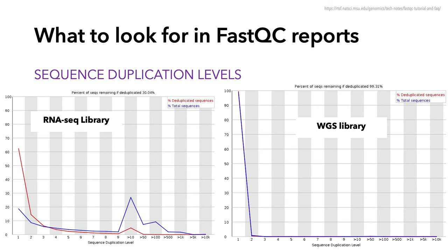Sequence duplication levels is one of the plots definitely not designed with RNA-seq data in mind. The blue line shows the percentage of reads of a given sequence which are present a given number of times. In RNA-seq, highly abundant transcripts will show up as duplicate reads, which makes sense. For whole genome shotgun sequencing, all your reads should be unique, so the blue line should be pretty flat. PCR duplicates during library prep will rightly raise a flag here, but for RNA-seq you can mainly disregard warnings or failures.